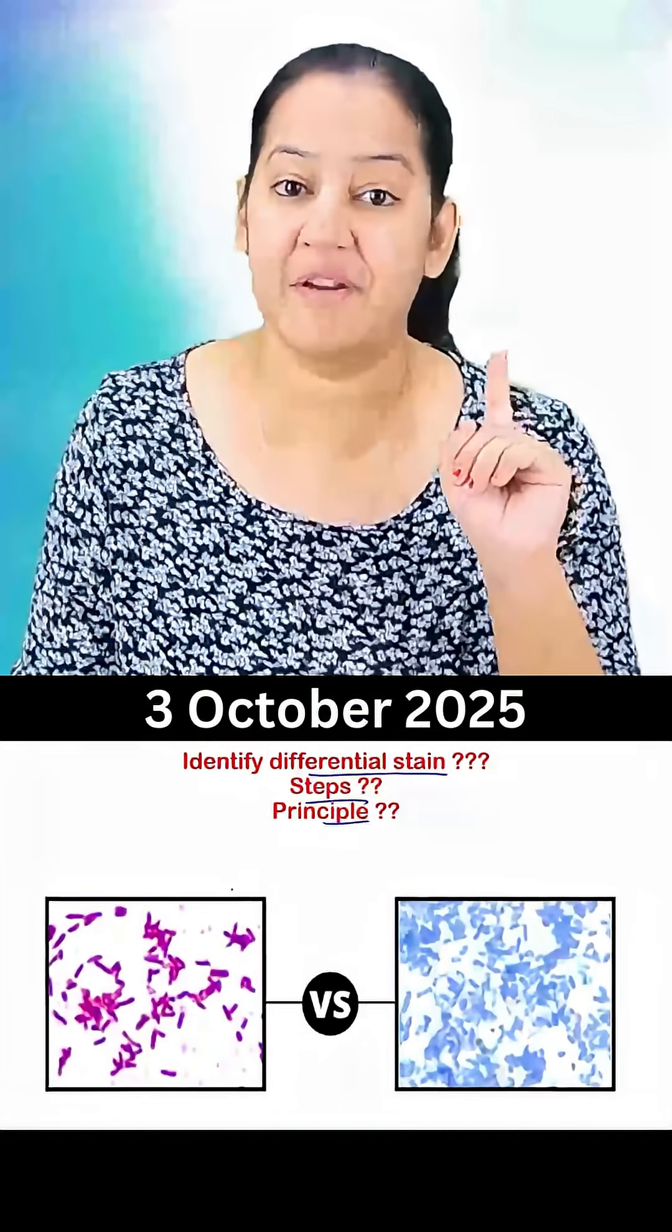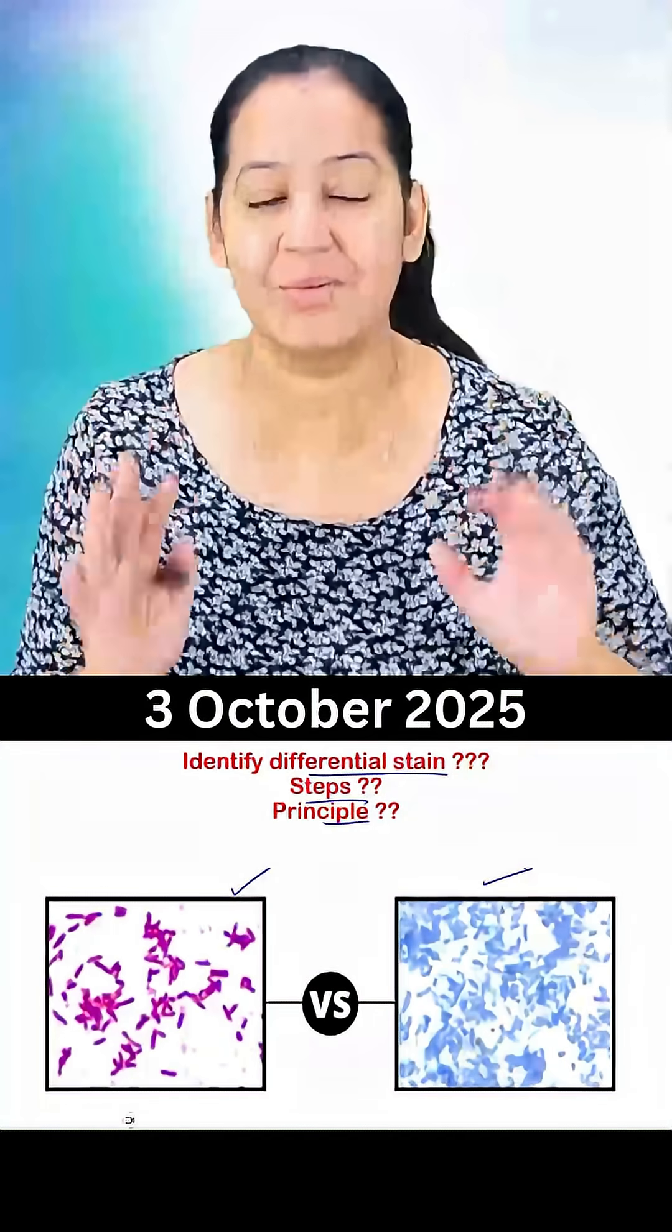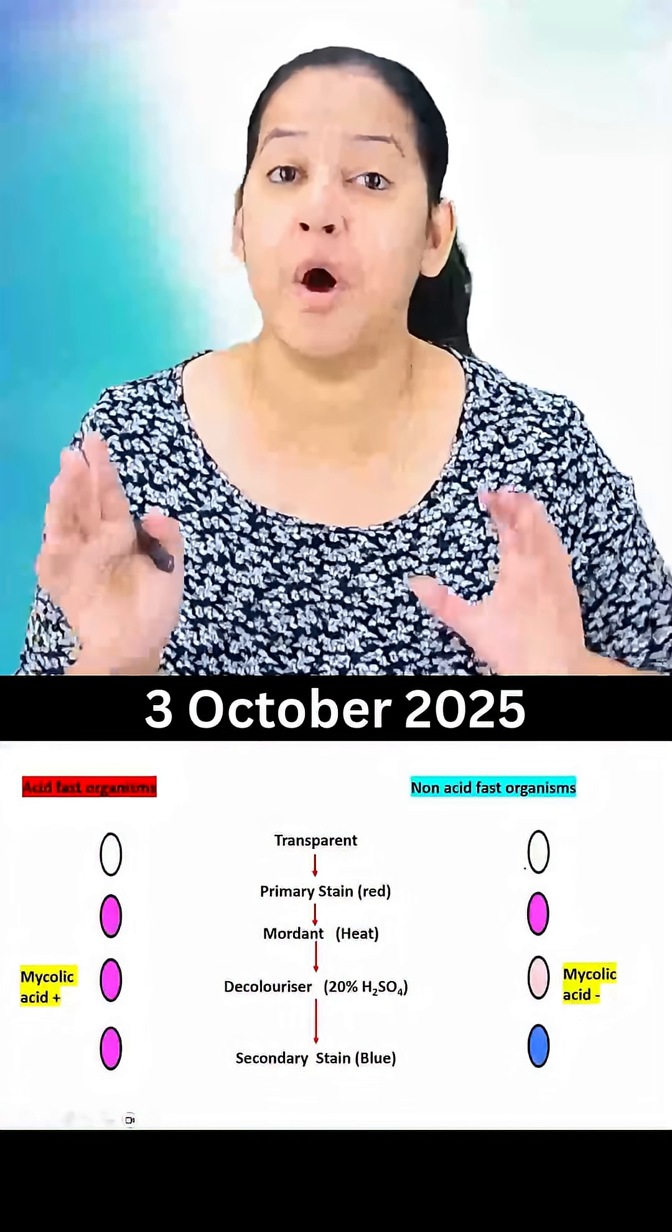In this image we can see some bacteria are red in color, some are blue in color. So this stain is acid-fast stain or ZN stain.